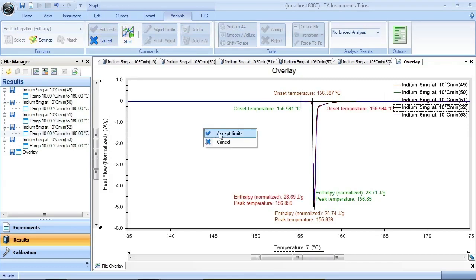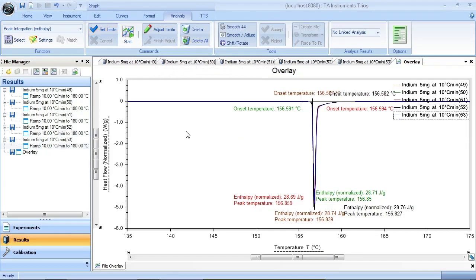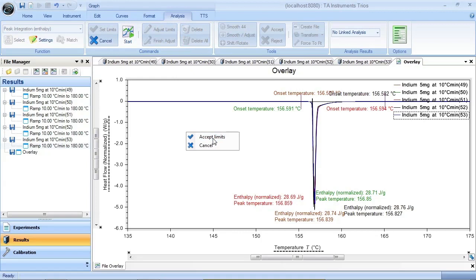I'm analyzing five curves now and I'm using the exact same limits. That's the key to getting repeatable measurements is to use the same limits.